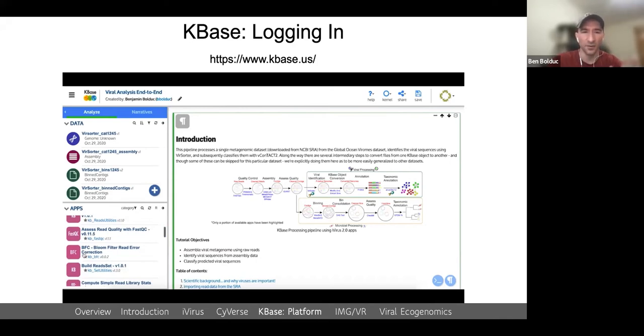And I'm not going to go over the pros and cons really of quirks with KBase, but KBase needs to have things in kind of a certain form or structure. And most apps don't natively work in those data structures. And so KBase provides kind of like connective tissue to basically get you from one app over to another app.